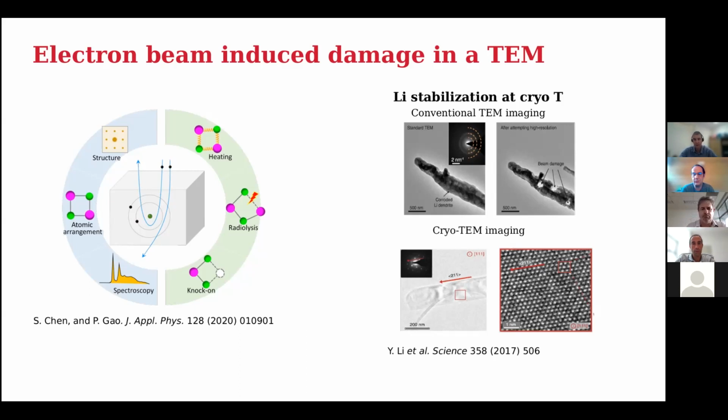And it seems that the spin polarization gets lost over tens of centimeters. So when your electrons reach the sample, they lose most of the spin polarization. But it's something that people are trying. Typically the idea now is to make devices that spin-polarize the current near the specimen, so we don't have this problem of propagation.